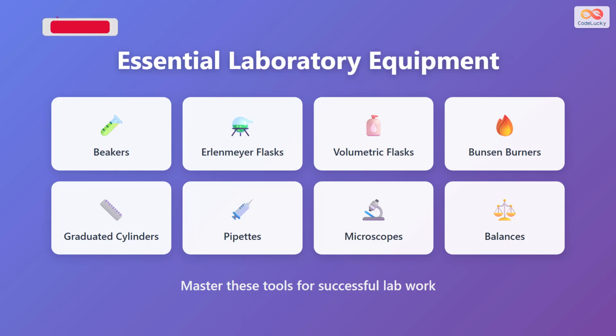We also acknowledge other important tools like microscopes for viewing tiny specimens and balances for precise mass measurements. Mastering these fundamental tools will set you up for success in all your laboratory work. Practice using each piece of equipment properly, and you'll develop the skills needed for safe and effective experimentation.